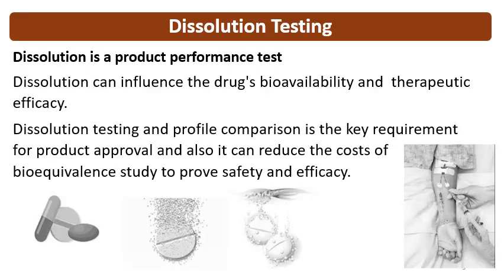Dissolution testing is a product performance test, and dissolution can influence the drug's bioavailability and therapeutic efficacy. Dissolution testing and profile comparison is a key requirement for product approval, and it can also reduce the cost of the bioequivalence study needed to prove safety and efficacy.